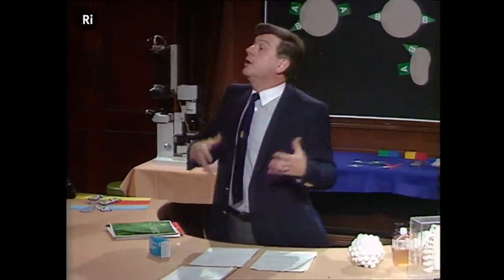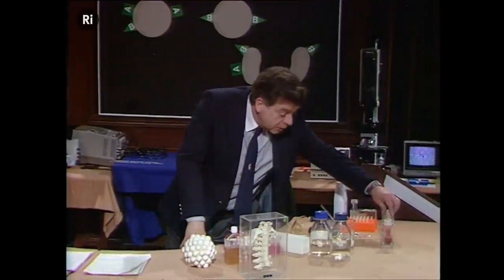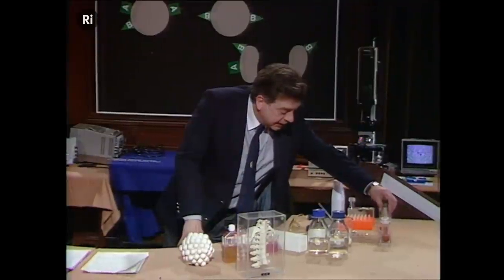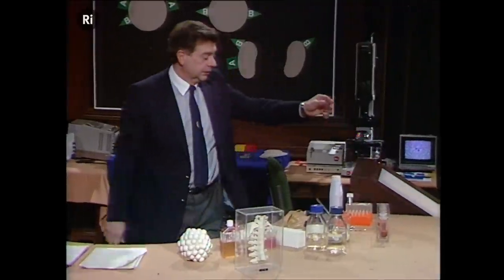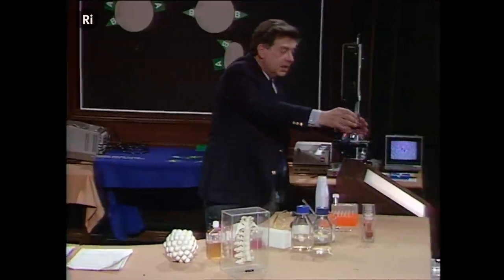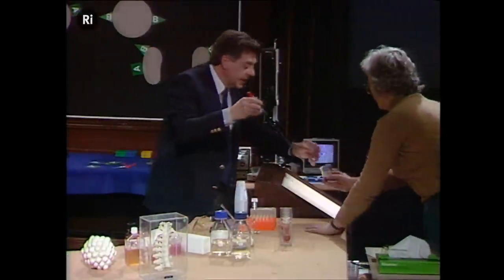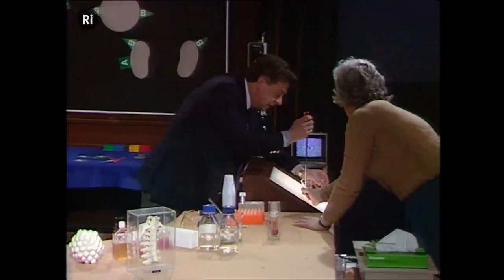So that's the way we do it with a real sample of blood. And let's show you how that works. We've got a solution here that's just like that salt solution. And here's our sample of blood, and Cynthia's going to hold it for me so I can show you that the first thing that we do is we're going to layer that blood on this solution.